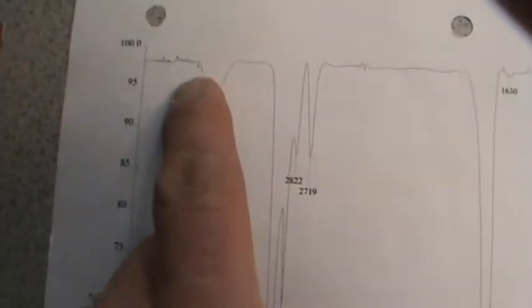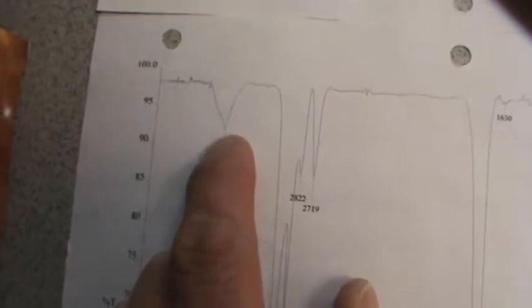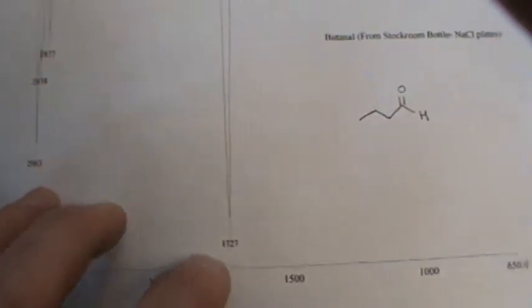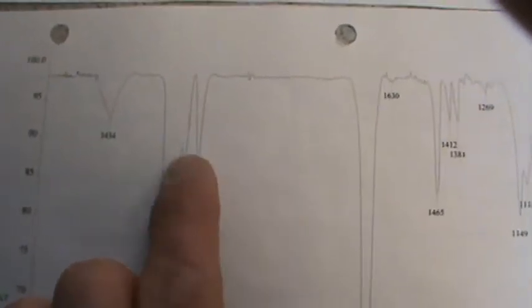This one, you know, this is sort of broad enough. It's not the nice characteristic, very sharp spike. Probably is the overtone with a touch of water, something like that in there. Now going back to the CH stretch where you're looking for the 2, this one that I did, you can clearly see the 2 right there. So you can circle those 2 and call it the CH stretch of the aldehyde.